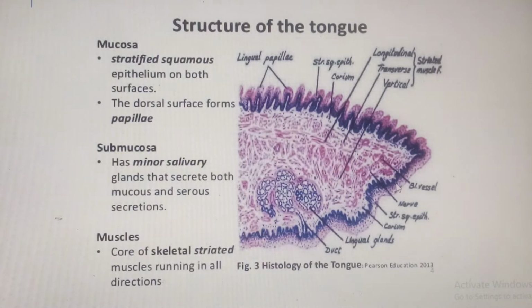Epithelial pegs. Now these epithelial pegs are very important because you use them to distinguish between some of these primary papillae that I'm talking about. Okay, so you have to know it very well. And then again, as the epithelial lining dips in, the lamina propria connective tissue over there will also be invading the vicinity of the epithelial lining, and that's what we call connective tissue papillae.